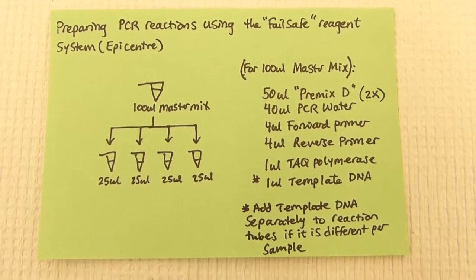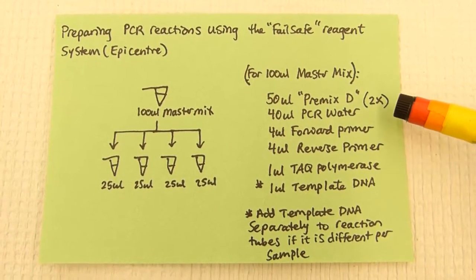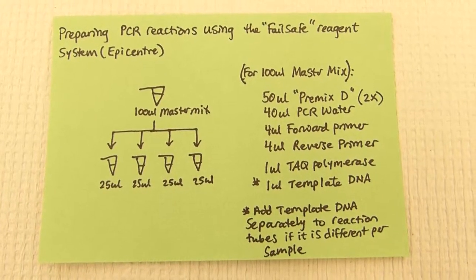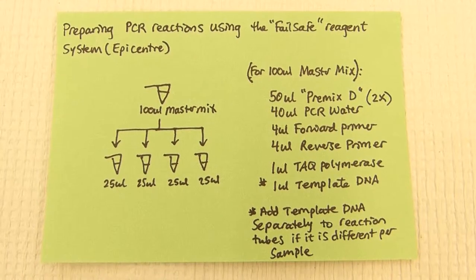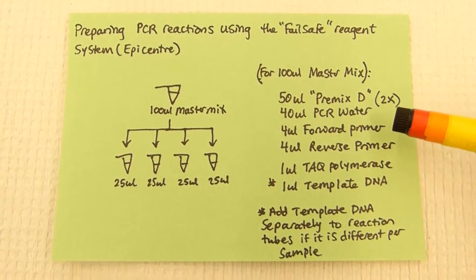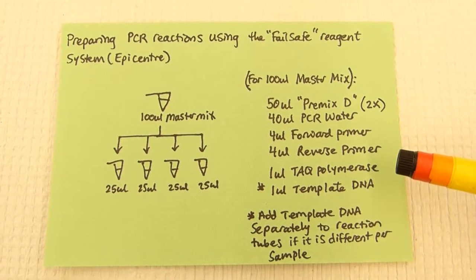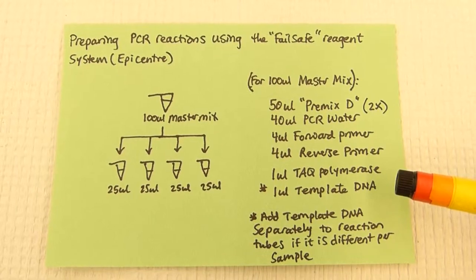This protocol is for 100 microliters of master mix. For this we would add 50 microliters of Premix D from Epicenter. This is a two times concentrated solution that contains our nucleotides and our salts buffer that will enable the Taq polymerase to replicate DNA in vitro. Next we add 40 microliters of PCR quality water, which is nuclease free, 4 microliters of forward primer, 4 microliters of reverse primer, and finally 1 microliter of our Taq thermostable polymerase.